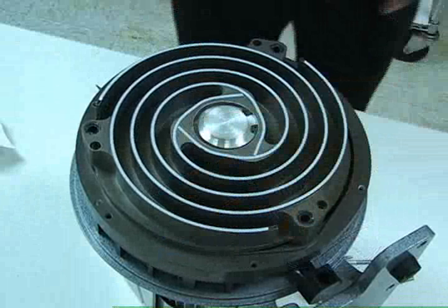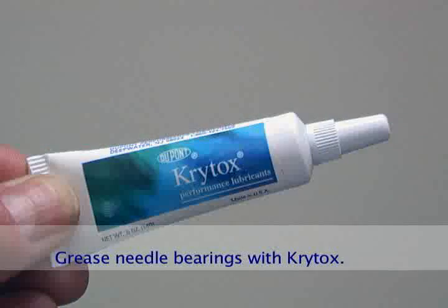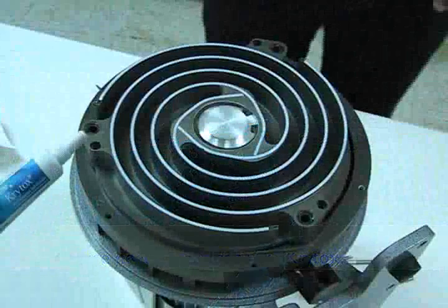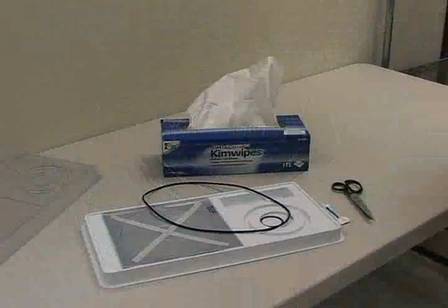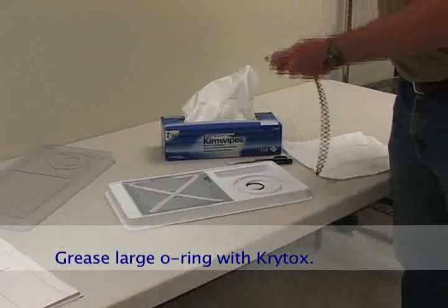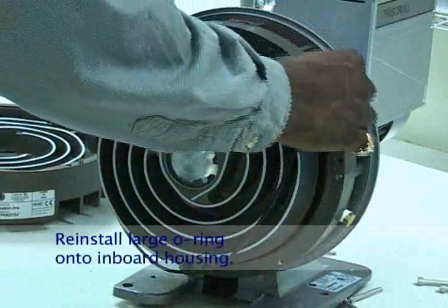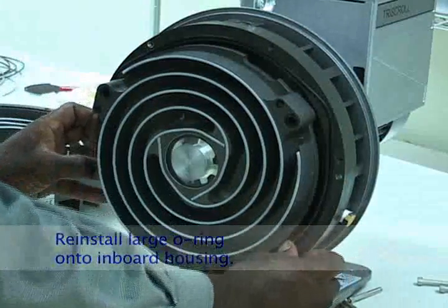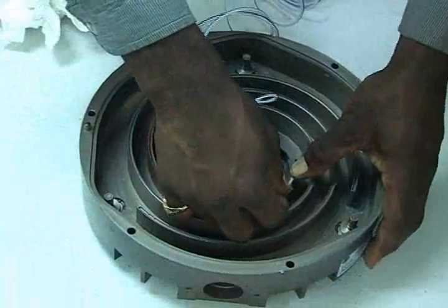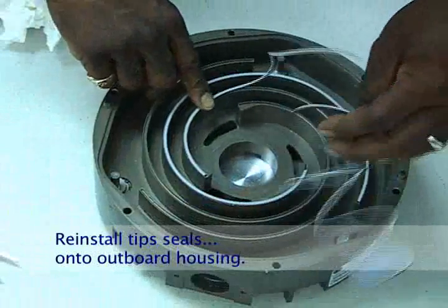Once the tip seals are in place, locate the needle bearings on the outside of the orbiting plate. Using the Krytox lubricant provided in the kit, squeeze a small amount into each bearing. Locate the large O-ring in the replacement kit and lightly grease it with Krytox. Reinstall the large O-ring on the inboard housing. Install the tip seals in the outboard housing using the same procedure as before, remembering to leave a quarter inch gap at the end.